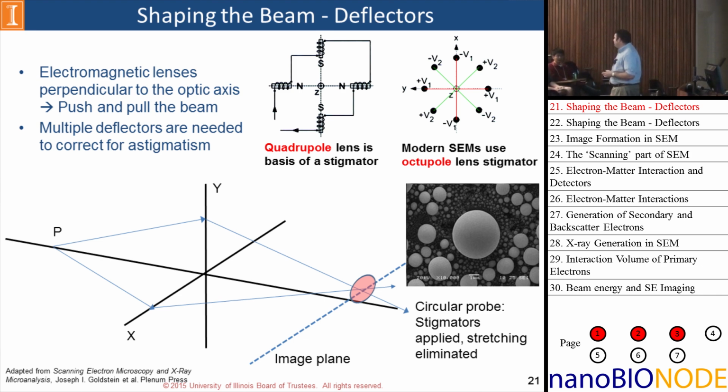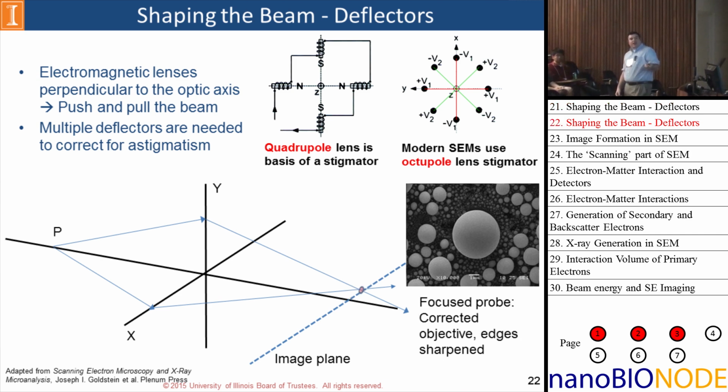If you correct your astigmatism to the point where everything is uniformly fuzzy, you're good. Next thing, change the focus of the objective lens, and now make that circle as small as possible, and you've got a nice focused image that you'll then take, you'll put it on the cover of Nature, and you'll make everyone famous.